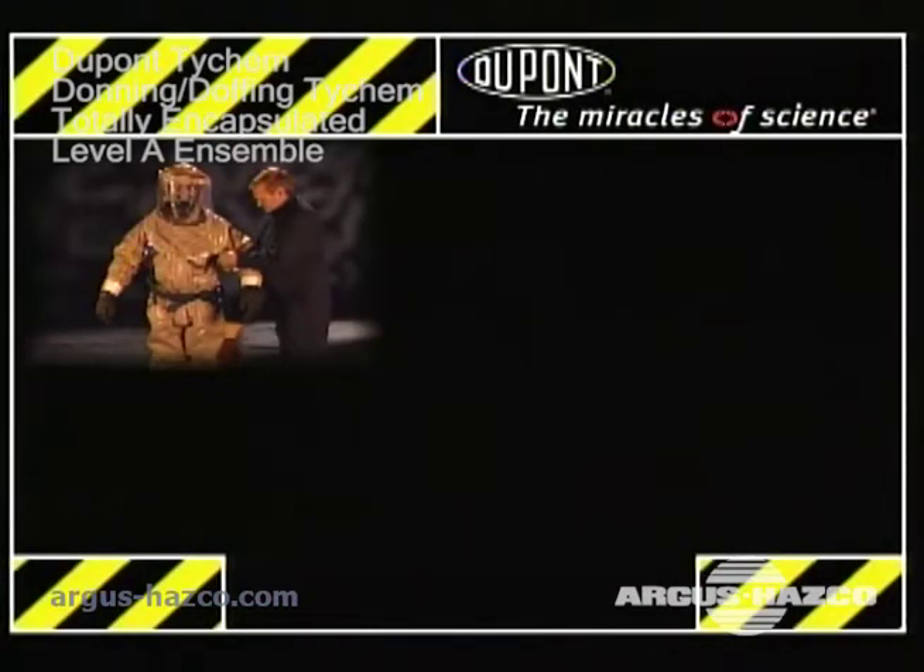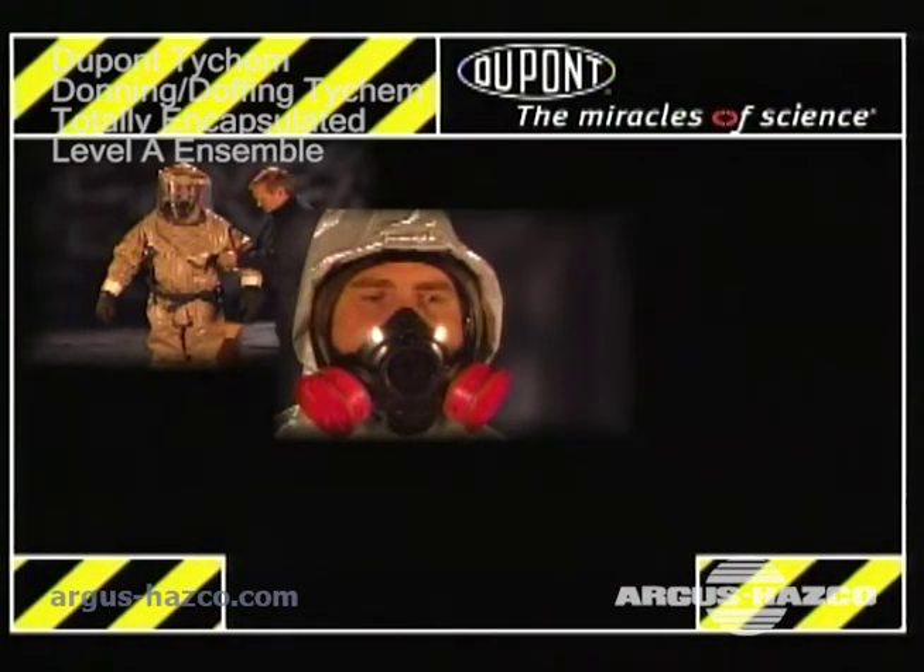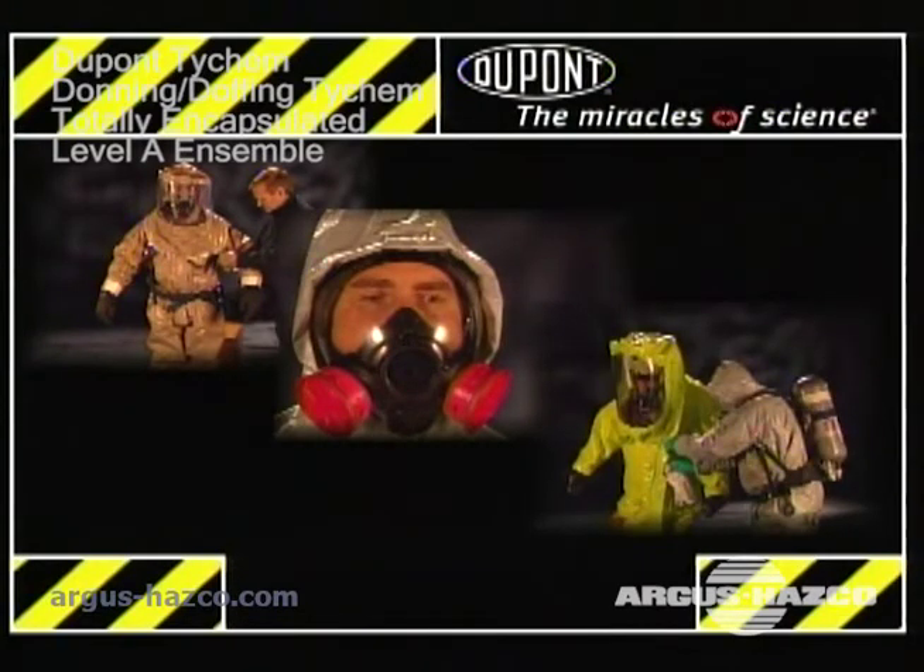This program will demonstrate the suggested method to don and doff DuPont Tychem limited-use protective clothing, showing you step-by-step how to put it on and take it off.